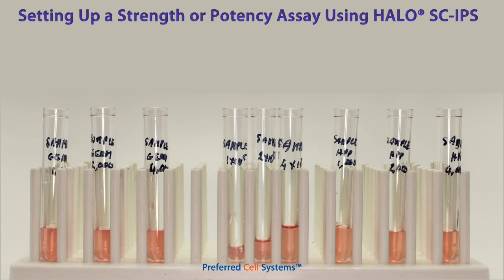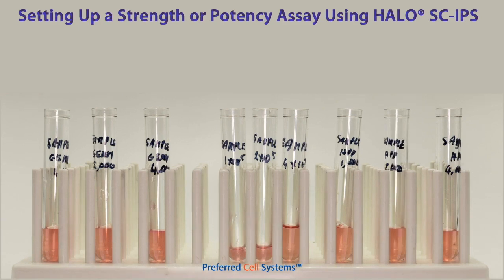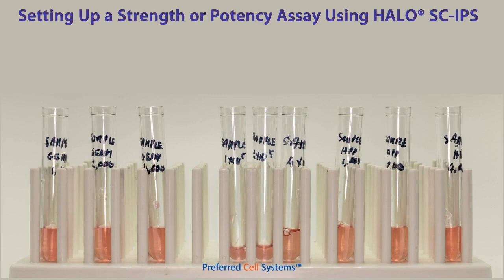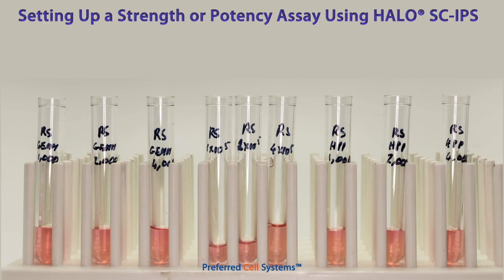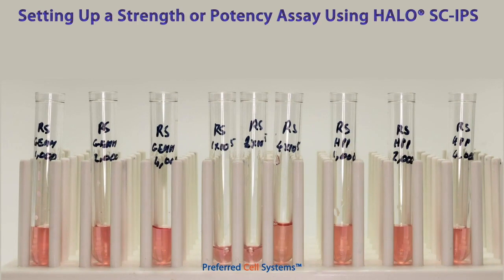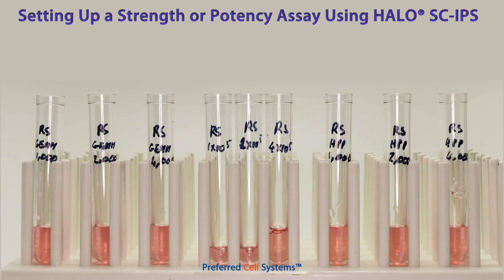This reduces the cell concentration tenfold to 10,000 cells. This is followed by dispensing the second sample cell dose, which is 200,000 cells per milliliter, to the second SC-IPS and second SC-HPP tubes. The cell concentration in this case is reduced to 20,000 cells. Finally, dispense the highest sample cell concentration of 400,000 cells per milliliter to the third SC-IPS and third SC-HPP tubes. The cell concentration will be reduced to 40,000 cells. In each case, you have now prepared the SC-IPS and SC-HPP Halo culture master mixes. Repeat this procedure for the reference standard tubes.